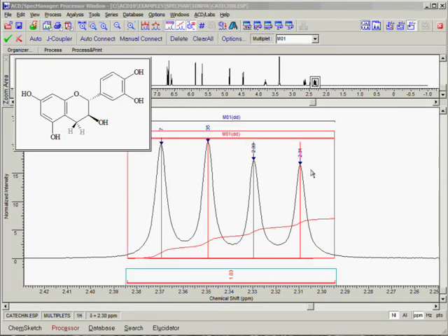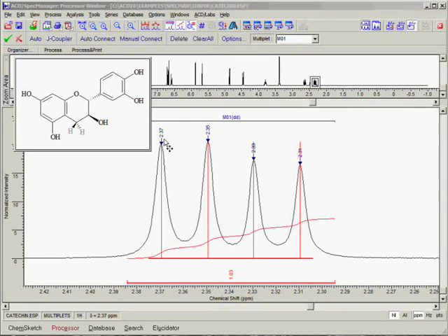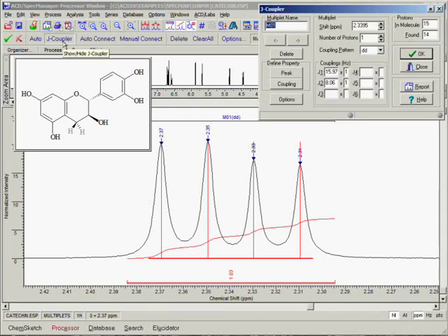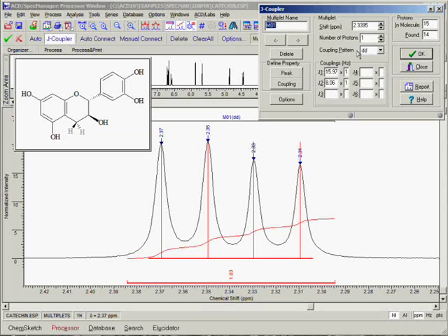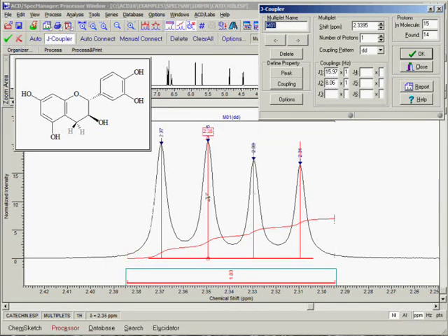Now we can review the results of the automatic procedure and make corrections if necessary. Open the J-Coupler dialog box by clicking on the J-Coupler button in the operation toolbar. Once again, we can see all of the relevant multiplet information in a single window. The two most important pieces of information to check are the coupling pattern and number of protons assigned. In this case, the coupling pattern has been correctly identified as a doublet of doublets, and the single proton assigned to this multiplet is correct. To proceed to the next multiplet, use the left and right navigation arrows on the J-Coupler dialog.